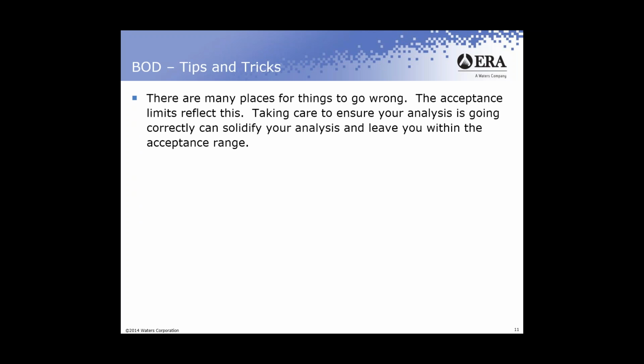So let's get right into our tips and tricks. And you're going to hear this a lot from me, especially if you give me a call to talk about some technical tips. There are many, many places for things to go wrong for BOD analysis. If you're doing your BOD on your proficiency testing, the acceptance limits reflect this. BOD has one of the widest sets of acceptance limits in all of DMRQA testing.